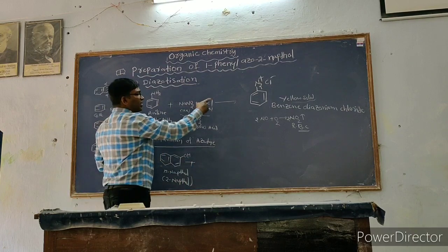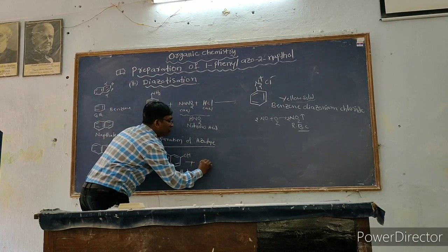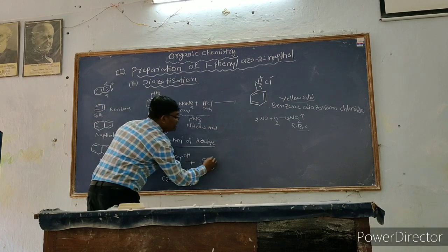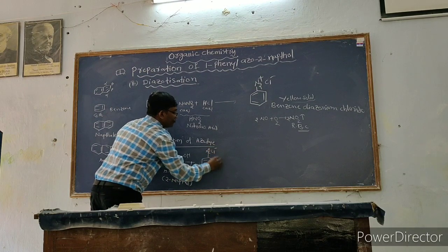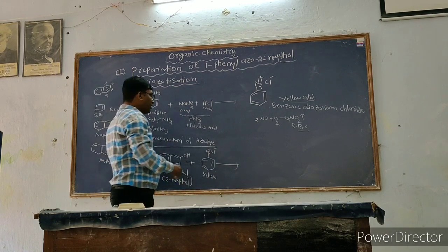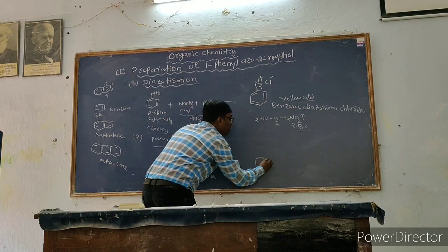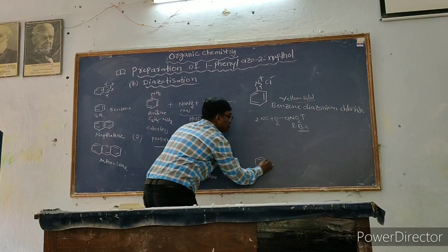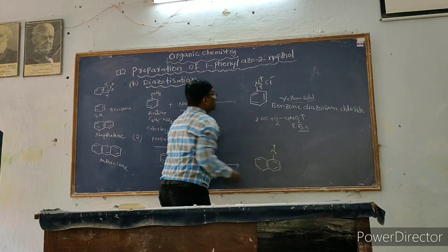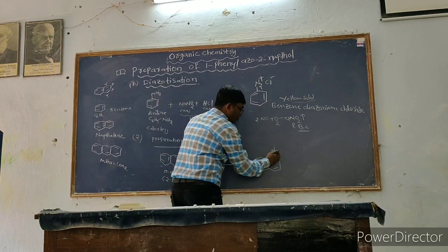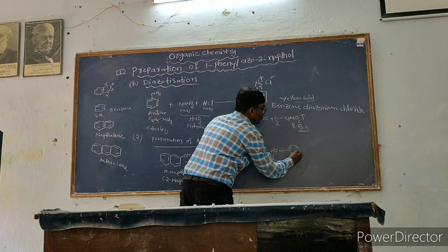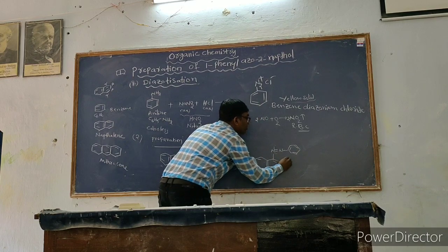Then we add the benzene diazonium chloride yellow color solid to the beta-naphthol, or alternatively we add the naphthol to the benzene diazonium chloride. What happens is we get an orange-red color solid as the product.